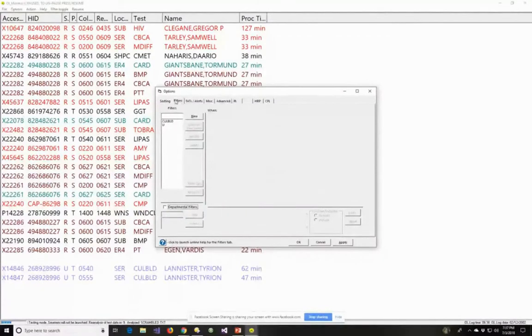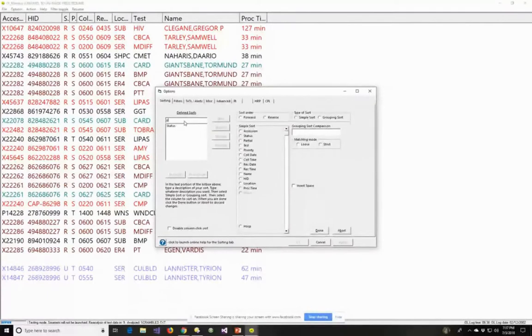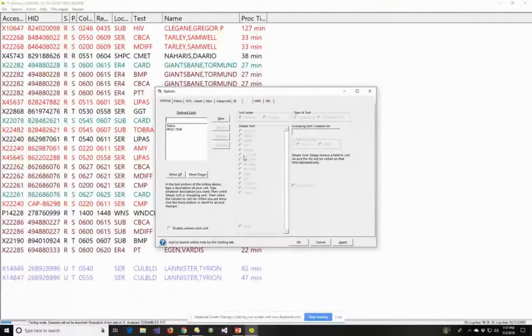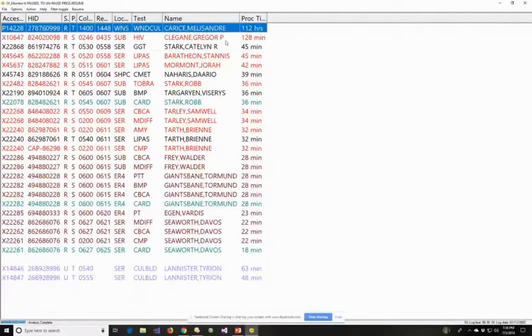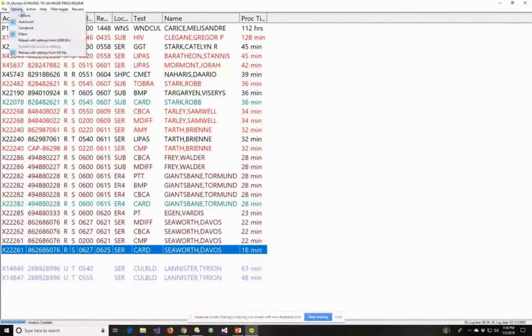Sorting — we need to sort this list, it looks awful. The best thing to sort on, aside from status, is process time. Just sort on process time — simple sort, done. Now we can see that the oldest test up here is a wound culture that's been out 112 hours. Now we know which tests really need attention — they're way up at the top, and the ones that just showed up in the lab are at the bottom.